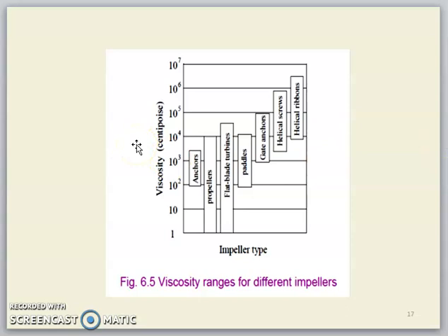The selection of impeller can be done by considering the viscosity range. So this figure shows the type of impeller that is suitable for different ranges of viscosity.